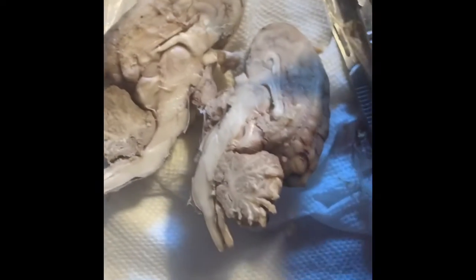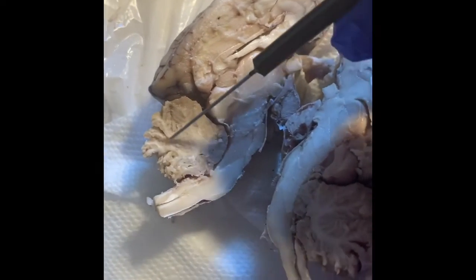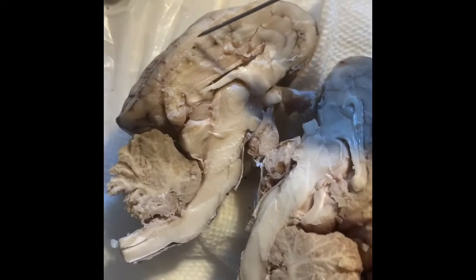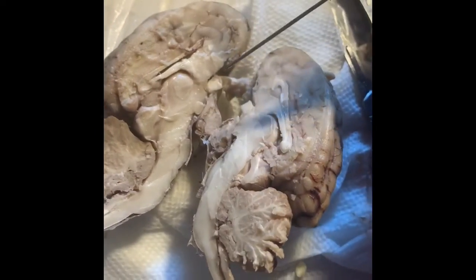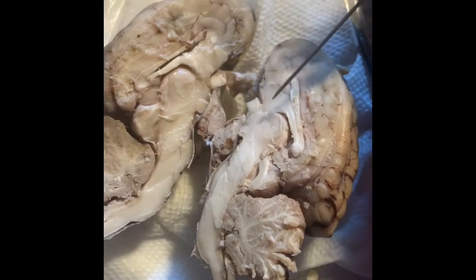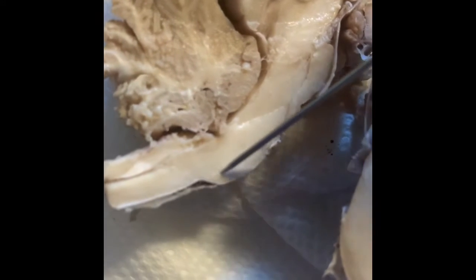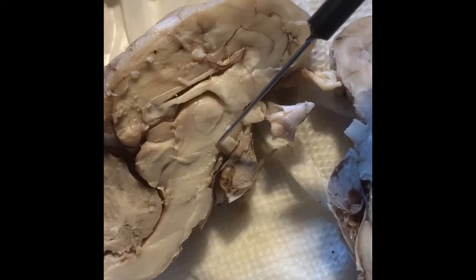All right, now that we have our mid-sagittal cut, we are now starting to see the cerebellum. It's more exposed, kind of looks like tree branches. And then we have the cerebrum, which is here. We've got the left and right side still. And now we can actually see the corpus callosum on both sides, right in there. This is the medulla oblongata right here. And then right up in here we have the pons, and then the thalamus and the hypothalamus.